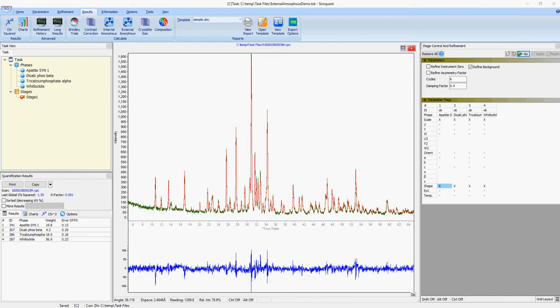As the name implies, the external standard method relies on running an external standard and does not involve spiking your sample as with the internal standard method. The external standard should be a standard with a known amorphous content. We recommend using the NIST corundum standard.